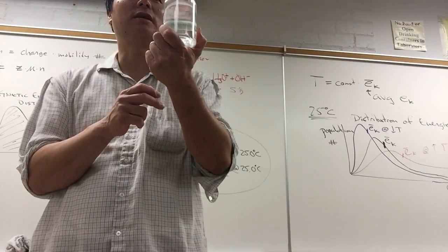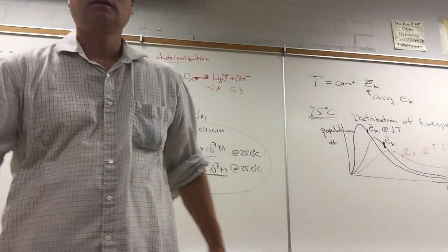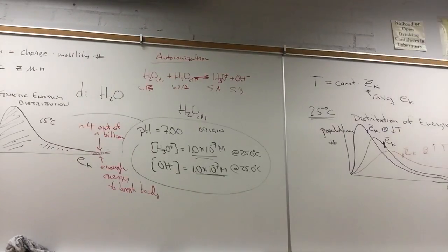Will this conduct electricity? Well, if there's ions present, it should conduct electricity, right?